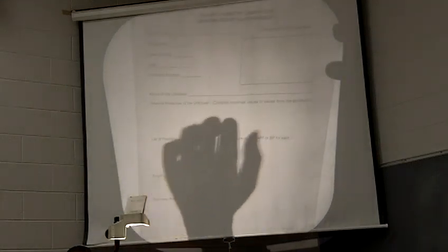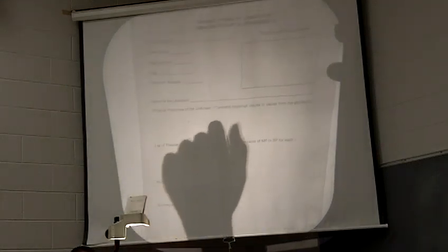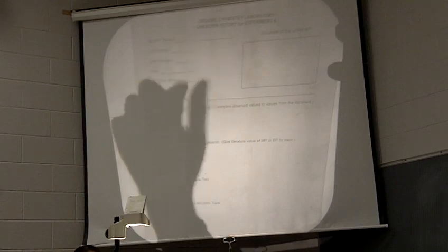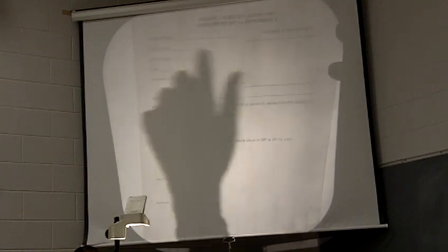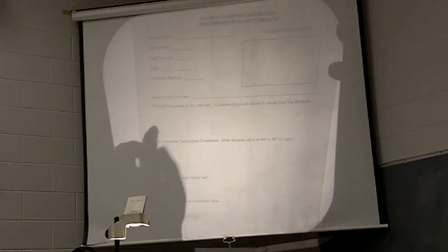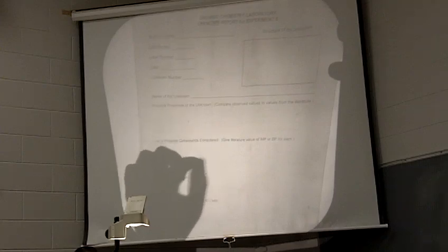All right, for this experiment, we're going to do something we haven't done before. In addition to a conclusion you're going to write, you have report sheets that you're going to fill out. These are at the end of experiment 6 for you, okay? So you're going to fill out all this information about your unknown and what is the name of the unknown. You'll list the physical properties. You'll give possible compounds you considered.